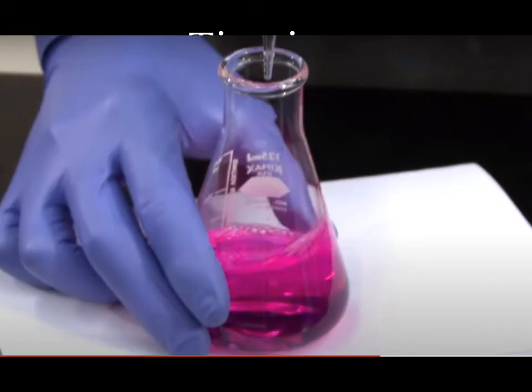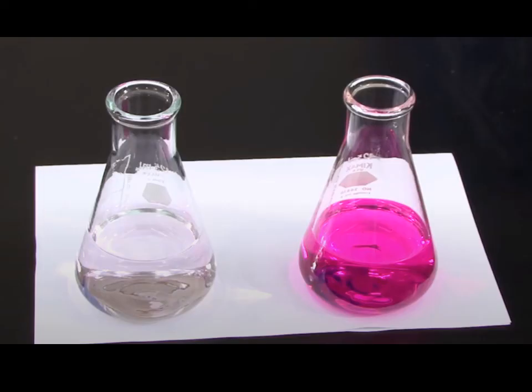Now, if we go past the neutralization point, oops, we went too far here. This is a really dark pink. This is indicating that the solution is completely basic, way past neutral. So this is called overshooting the end point. This is going too far. So if this happens, there are ways to fix it. You can try again, you can recover from it. And eventually what you're trying to do is get a nice light pink color, not this dark, dark pink color. So this one was a boo-boo. This was a messed up one, but the person could try again.